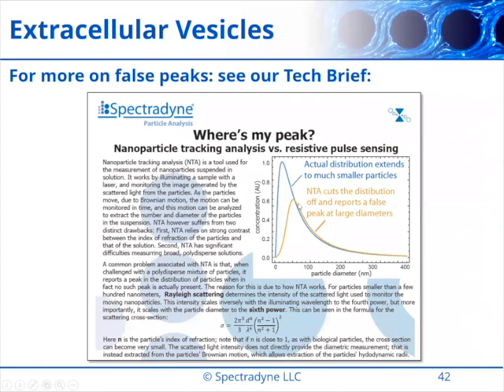So you've got to be careful. If you just blindly measure NTA and assume that the data is good to 0 nanometers or 20 nanometers, you will maybe be led to conclude that there's a peak around 50 or 70 nanometers. That would be an erroneous conclusion. We see this all the time from EV researchers and to some extent with aggregation researchers. So we'd love to prove this to you in more detail, but we do think that there's quite a bit of misleading conclusions out there from not understanding this phenomenon completely.